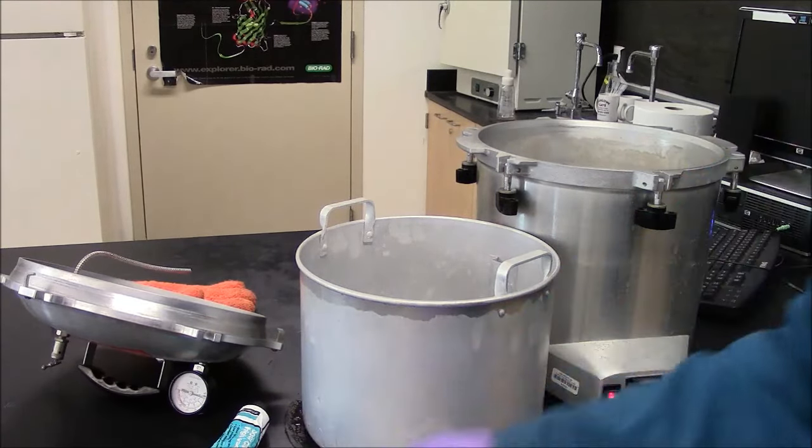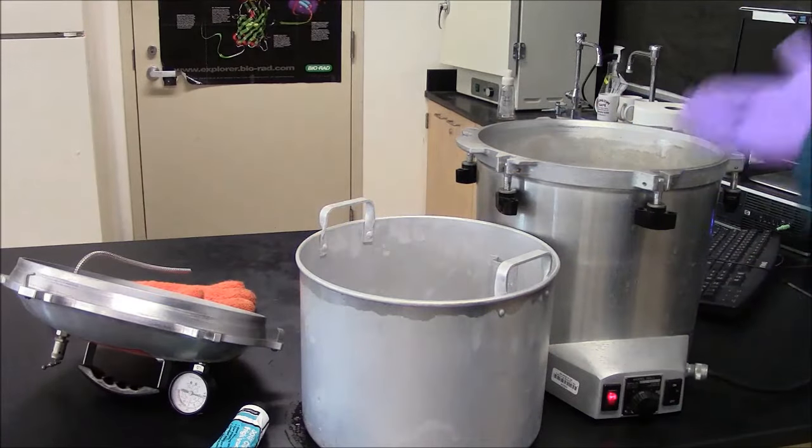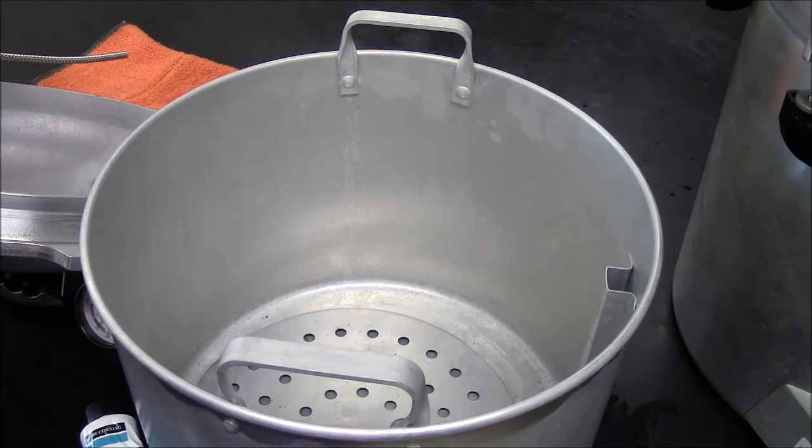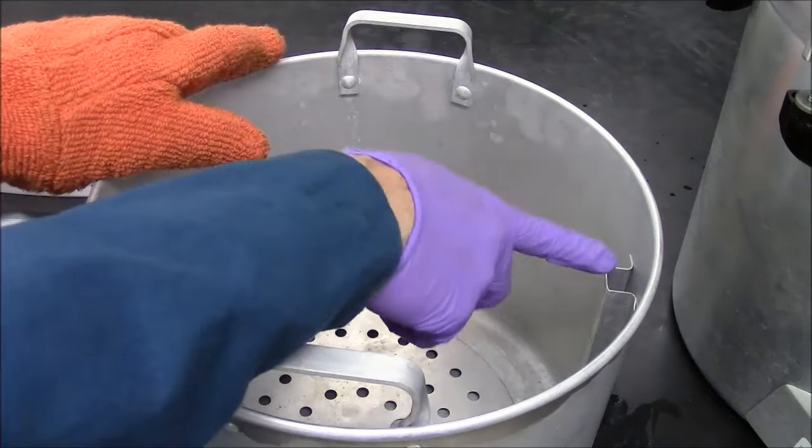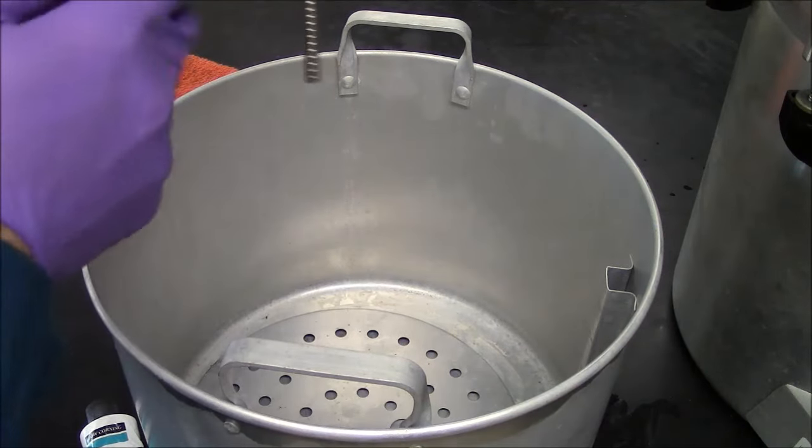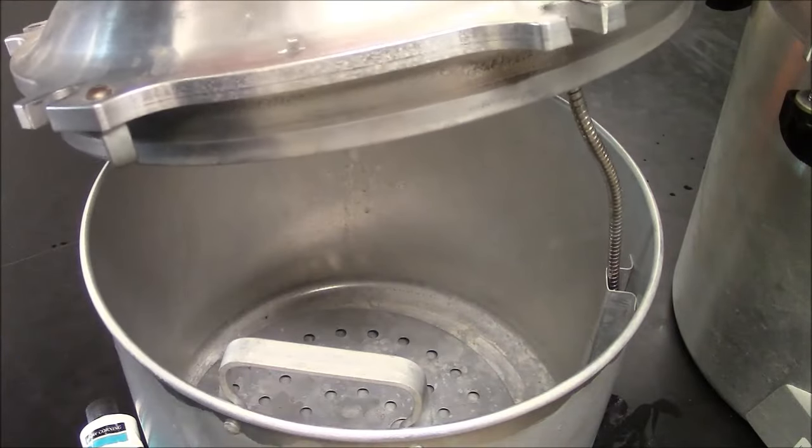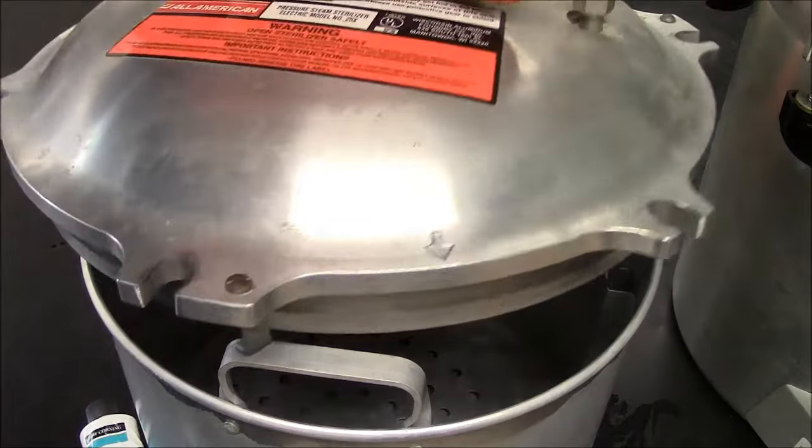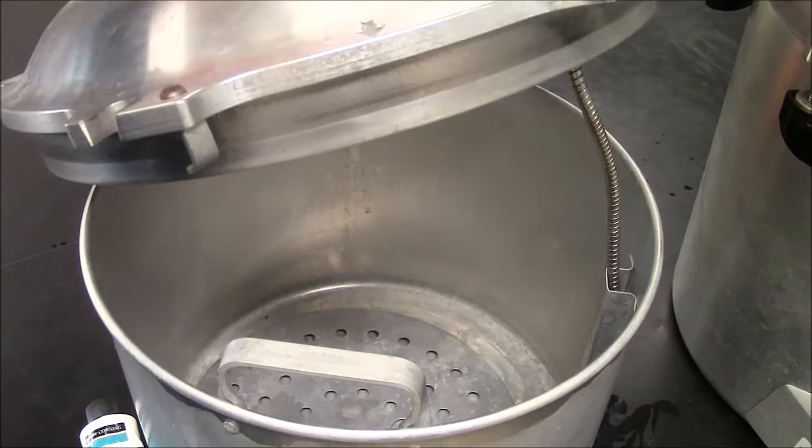Vacuum grease can be useful because you need a seal here so that the steam does not escape. The container for the materials has a little channel here on the side. The lid has a tube that fits in the channel. So when you assemble it you have to make it so this can fit in that slot there.